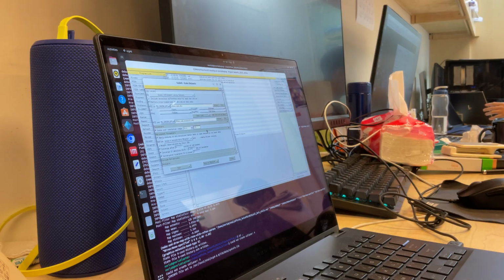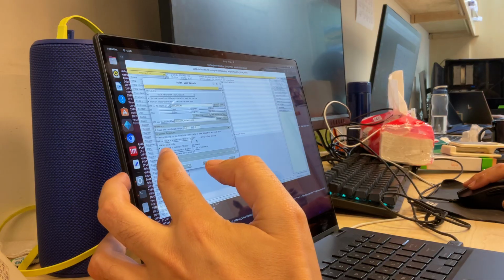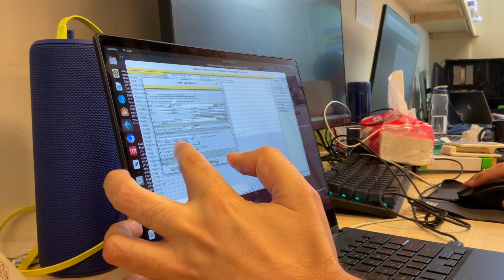The region where you have strong peaks but still far away from saturation, with small standard deviations because you have measured them a lot of times, is this region, 10 to 2.5. Therefore, which is sort of the medium resolution range, for calculating the scaling factor it's better to use this region. However, the scaling factor will be applied to the entirety of the dataset, not only to this region.